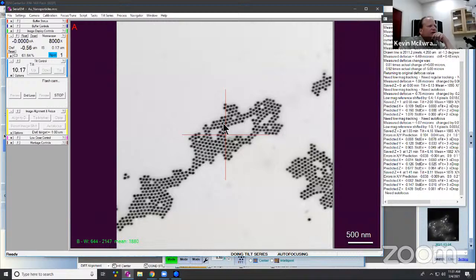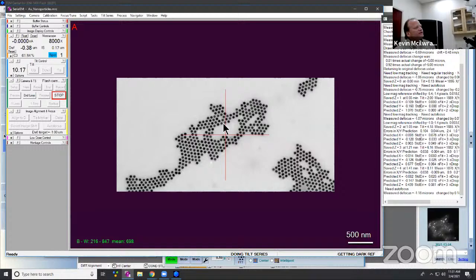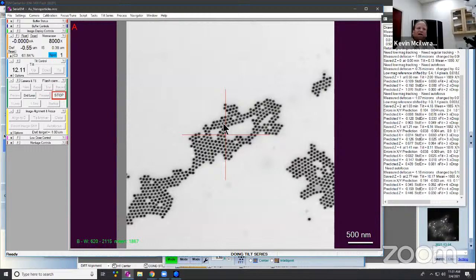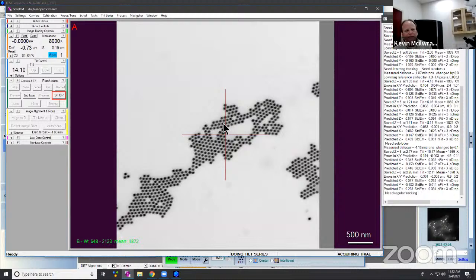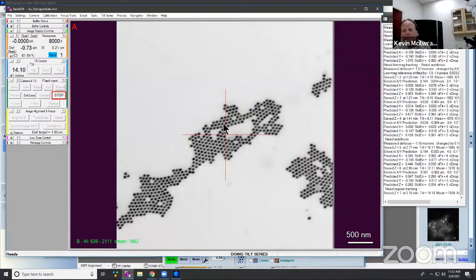Okay, the way that this sample is moved is, this is one of those things where everybody's a little bit different. So if you look at JEOL, we have this actuated stage for the more coarse mechanical movements. And as we go from like 100X to 1,000,000X, the software slows the stage down, so that it moves in about 2 nanometer steps at its smallest setting. And then we have a piezo stage on the higher-end materials scopes where you're doing a lot more atomic resolution. Those will have a sub-stage, like a piezo stage.